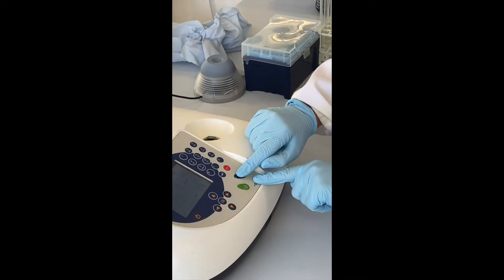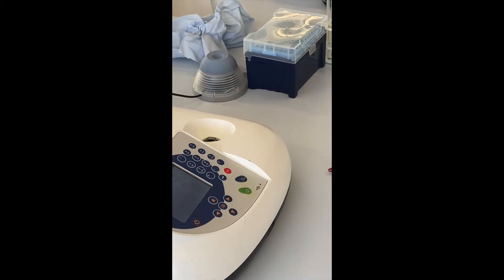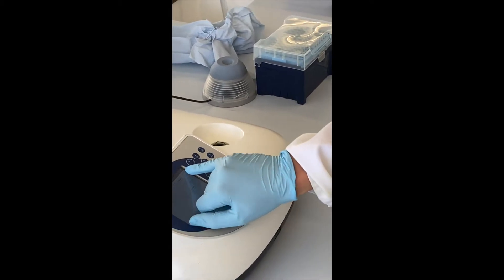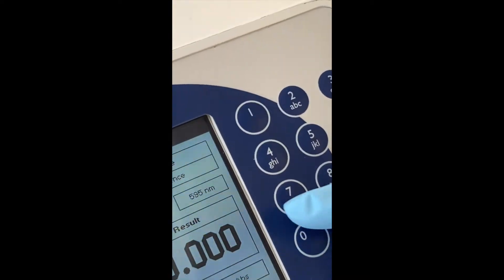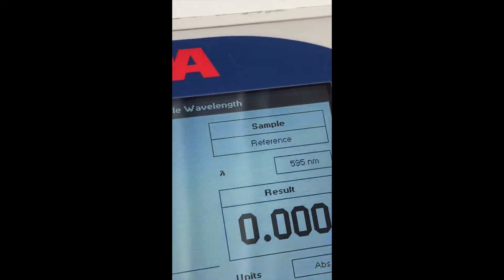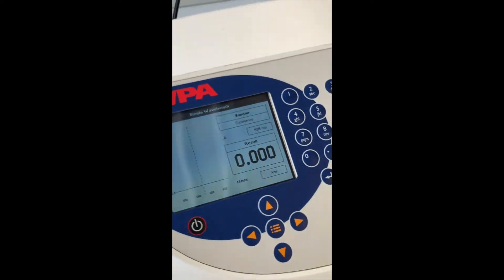You'll press the blue button then to blank the machine. A small light will appear on top, and it will give a reading of zero, saying that the spectrophotometer has been blanked.